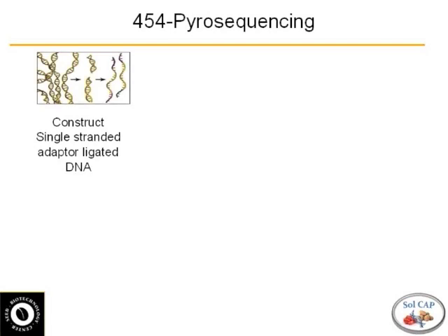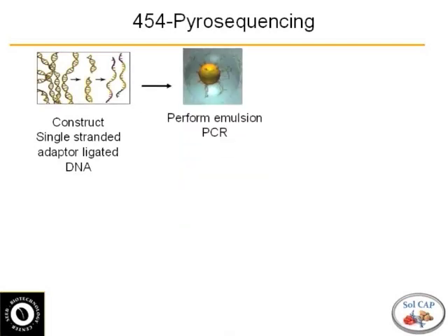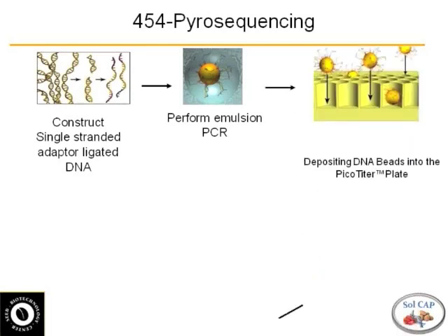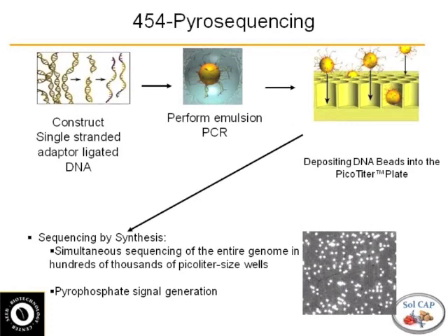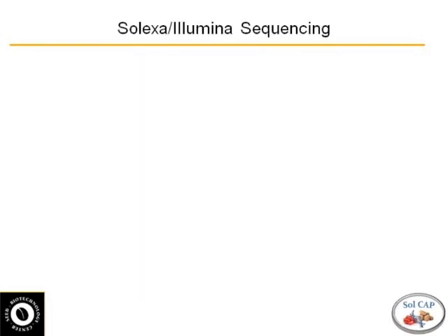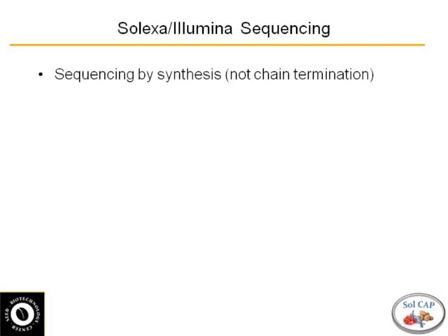Instead of cutting with a restriction enzyme, they actually shear the DNA into single strands. They put adapters on the ends of those DNAs and those adapters are the primers that drive the sequencing reaction. The key difference between this and Sanger — and really all the next sequencing technologies — is there's no cloning step. That makes things a lot easier and allows you to sequence in a highly parallel manner as opposed to one clone at a time. The sequence is amplified on little beads using emulsion PCR, and by adding single nucleotides one at a time and looking at the light reaction coming off at a specific base at a spot, you can get a sequence. This is highly parallel — you get hundreds of thousands of sequences simultaneously.